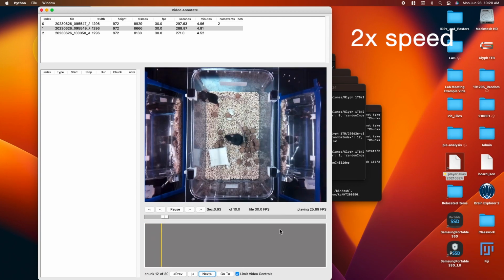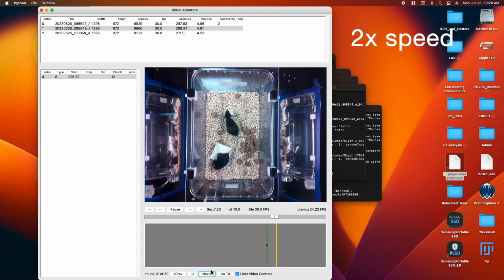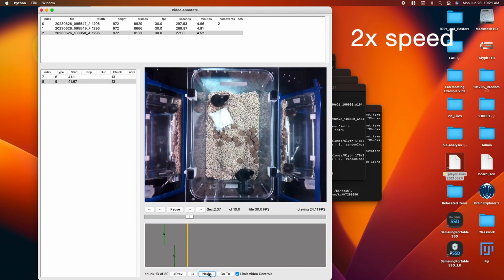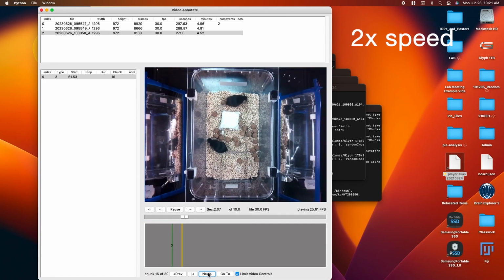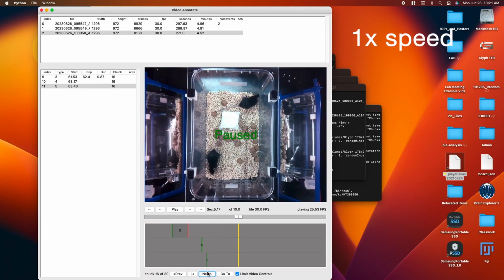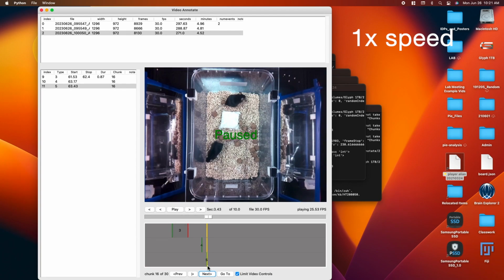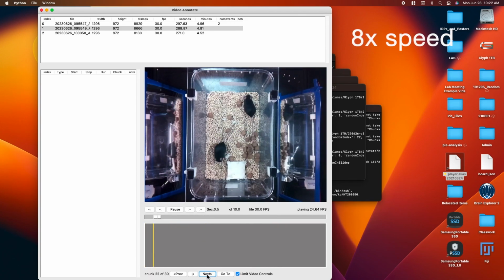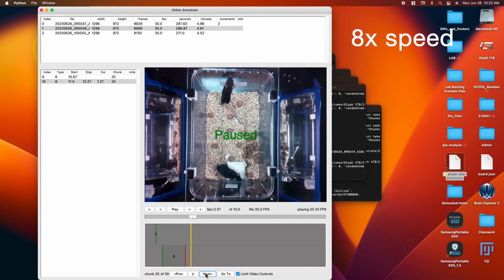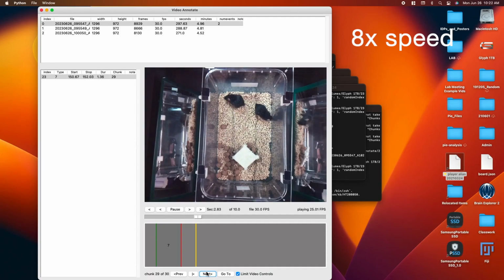Now we'll navigate forward, marking mock events on a number of chunks. Before showing how to edit event number 5 by clicking it with our cursor, and then using the F and L keys to change the first and last frames of that event. Now we're just quickly going through and adding mock events to the remainder of the chunks.